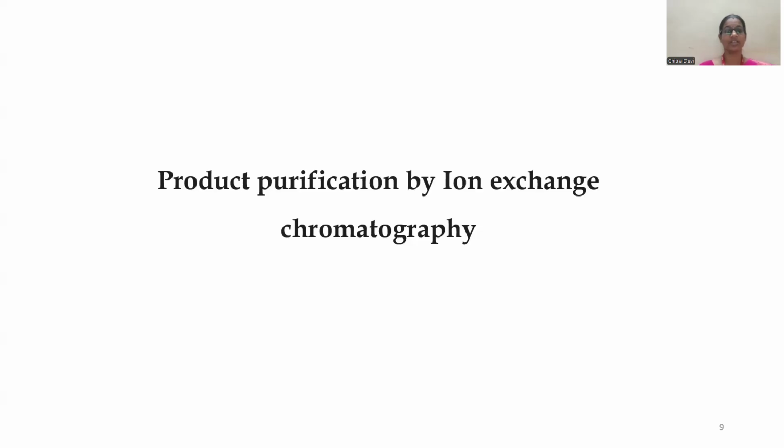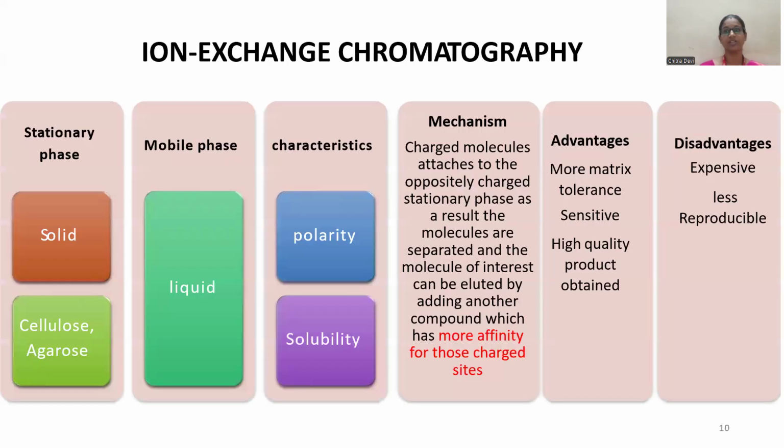Good morning, students. Today we are going to discuss product purification by ion exchange chromatography. It's one type of column chromatography. So I will be giving a crisp introduction to ion exchange chromatography here.